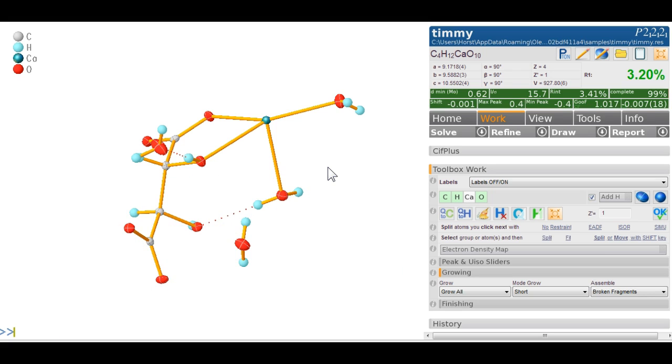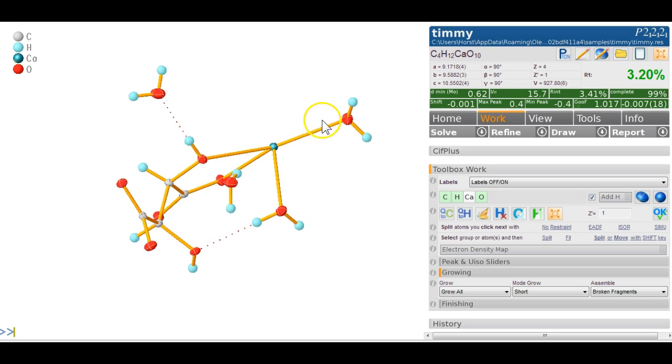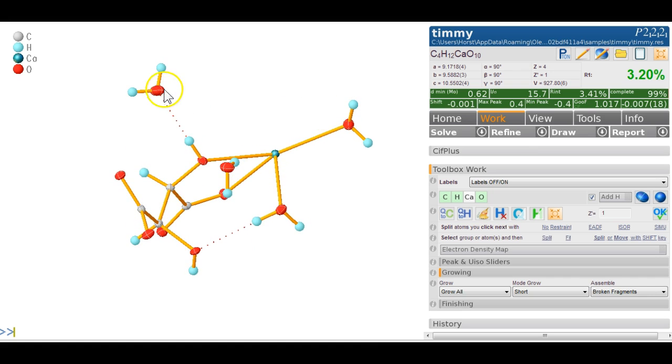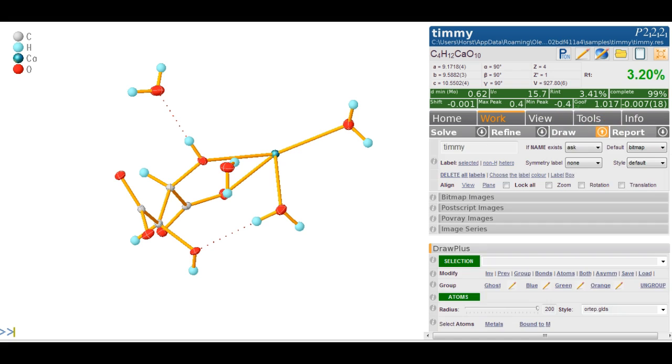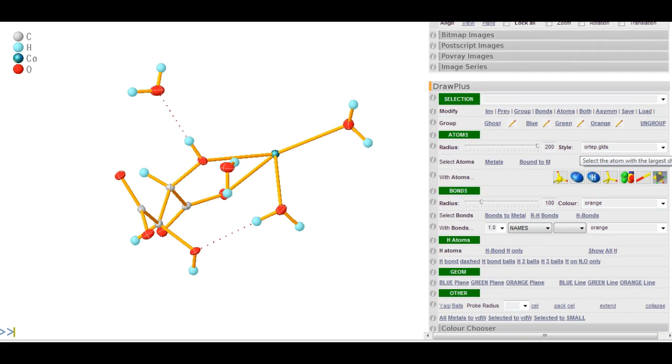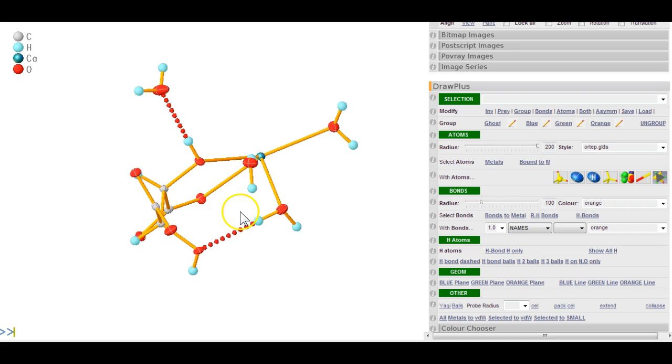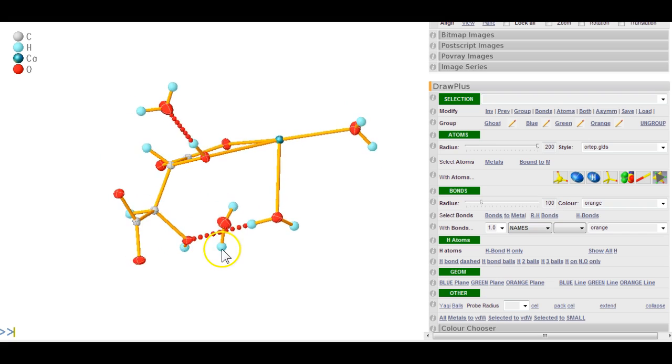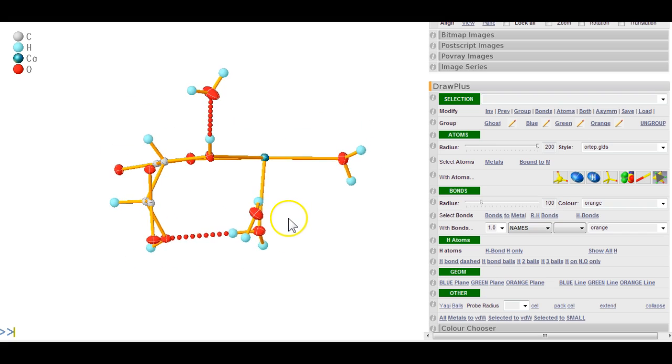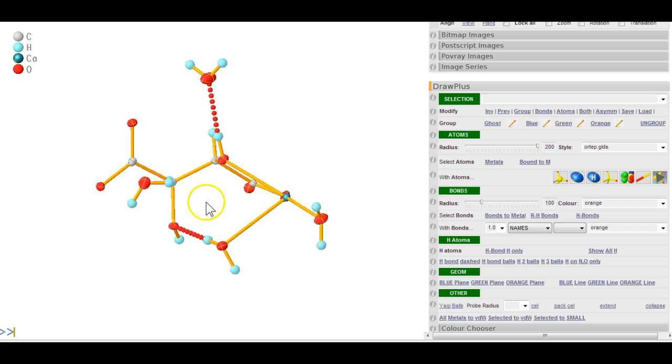To get a clear screen again, the second thing you notice is the hydrogen bonds here, they're not very visible. Let's head over to the drawing module. I've installed the extension module draw plus, where we have an easy way to change hydrogen bonds display so we can clearly see where they are.